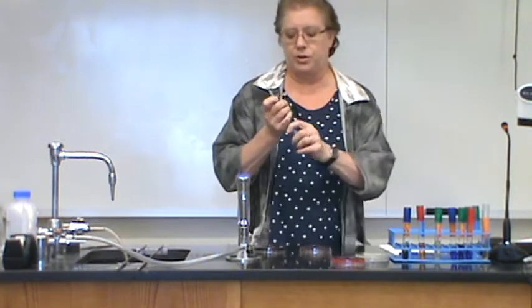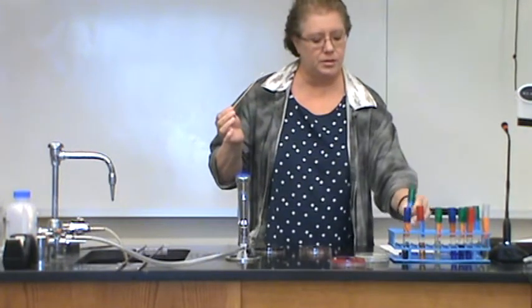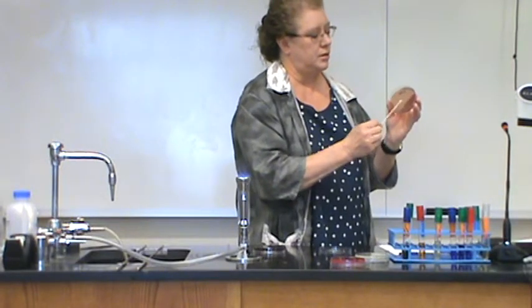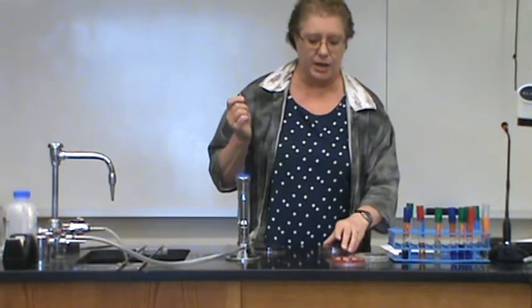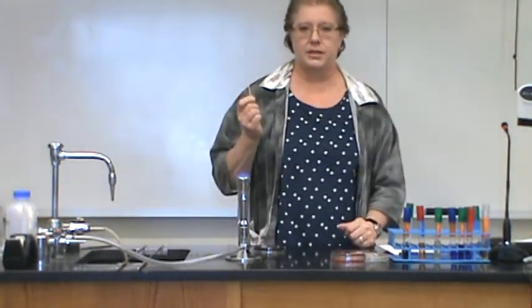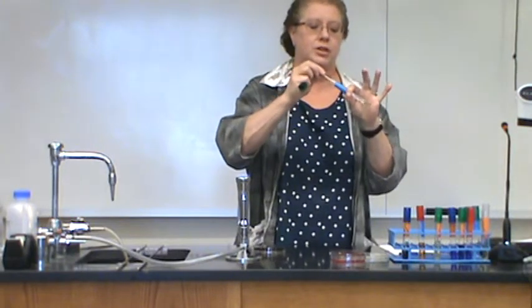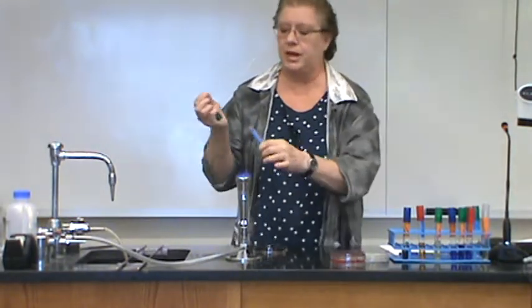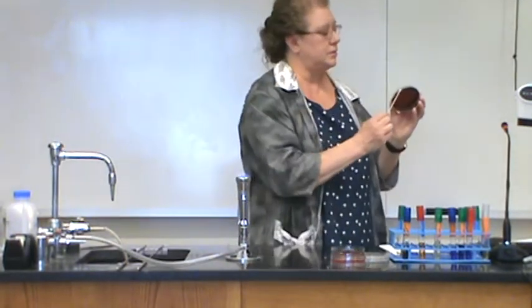So you pick up your unknown number 1 again, flame the top, get a fresh sample, flame the top, put the lid down, pick up your MacConkey plate, and just go ahead and gently go across the surface of the agar to inoculate the MacConkey plate. Set that aside. Again, you can continue to use this swab. Pick up your unknown, flame the top, get some fresh culture, flame the top, and then inoculate your EMB plate the same way.